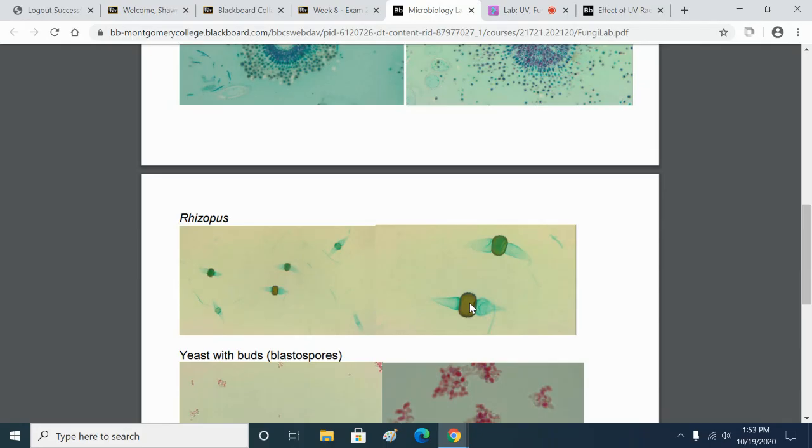So spores can be the result of meiosis, as is the case with the zygote, or they can be the result of mitosis. A haploid fungus can make haploid spores. So either mitosis or meiosis can be used, but the end result will be haploid spores. And the zygotes are big. I mean, this is not even a 400 times magnification, and you can still see how big they are. So they're huge. But this is an example of sexual reproduction in a fungus.